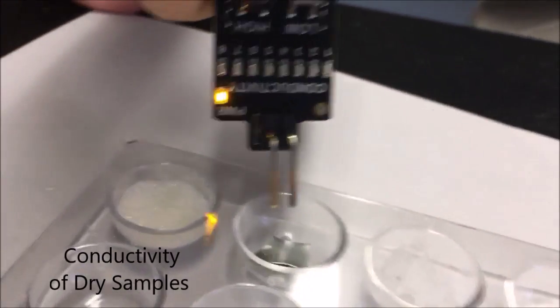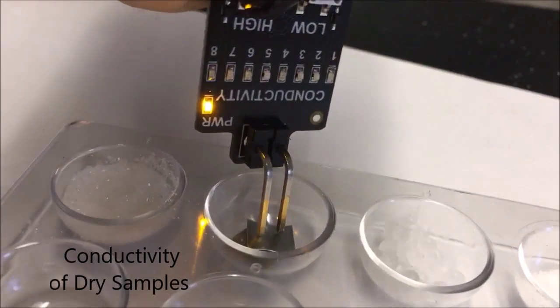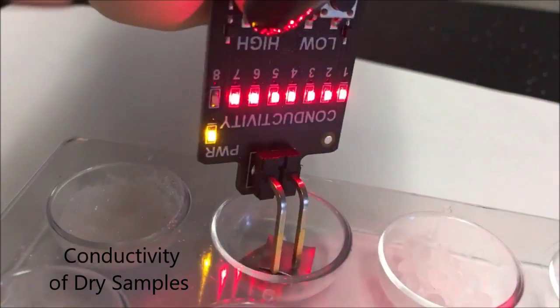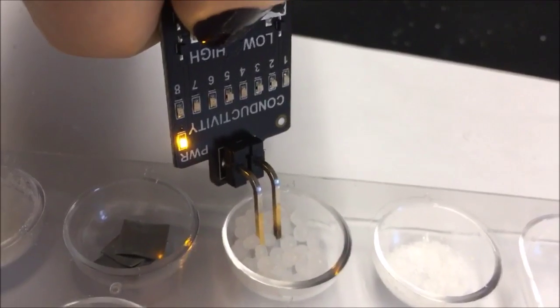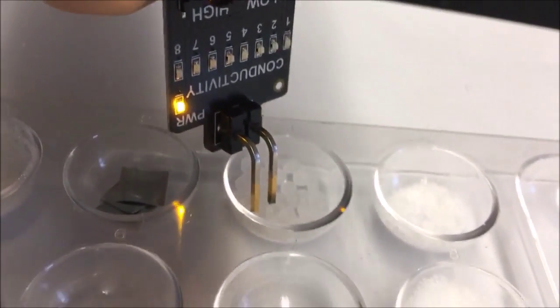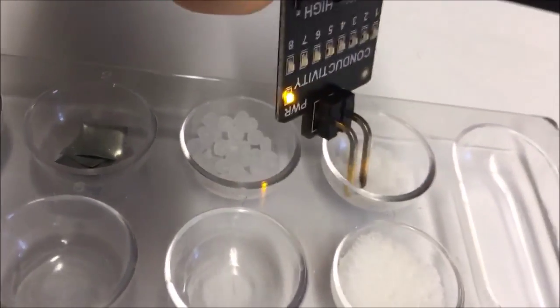In order to test the conductivity of the dry samples, my group placed each sample into a plate with small half-spherical depressions. After this, a group member placed an electrode into each depression to measure the conductivity. This resulted in zinc being the only conductive solid.